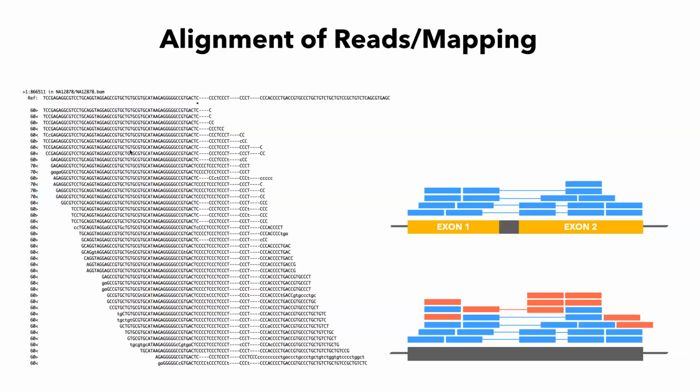So that first step in a lot of these mapping techniques is called indexing. Indexing means we organize reads into groups by their beginning. So we try to align them. All of these begin with TCCGA, we put them together. These begin with CCGA, we put that next. This with GAGA, we put it next, right? So this is called indexing. And then based on this index, we can align them much faster to the reference genome.